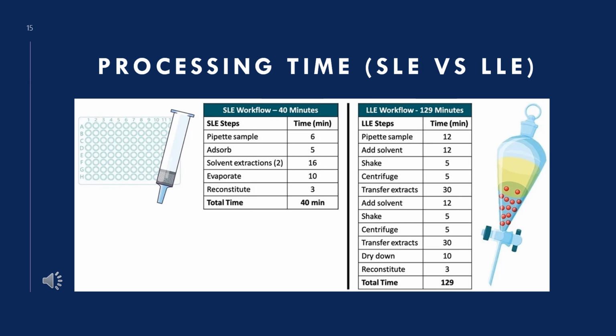And in this method, the need for shaking and manual extraction of the solvent layer are eliminated as a result of the efficient interactions via solvent flow. So this method can be easily automated by combining 96 well plates and robotic samplers that allow a great number of samples to be processed in a single day, and also enable higher throughput of the samples. So eventually it is better in terms of processing time than the liquid extraction process.